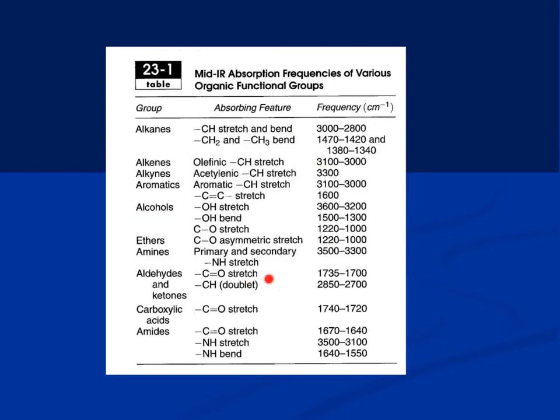If we see a stretch of CO at 1735, it means aldehydes are present. If we see OH at 3600, which is very common in water-containing samples or sugars, then we can see this peak. So it's kind of a fingerprinting, where if this peak is present, then we can expect this kind of structure. And that's the whole thing about spectroscopy.